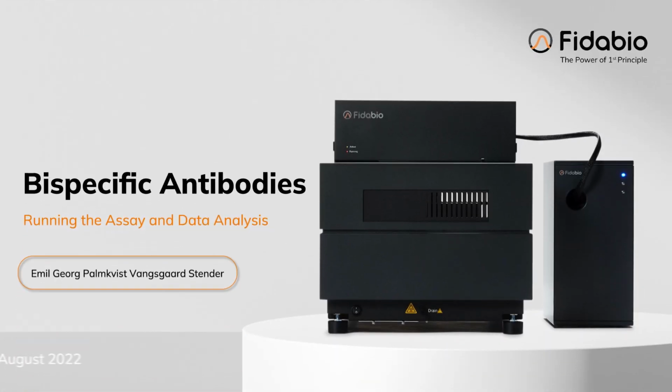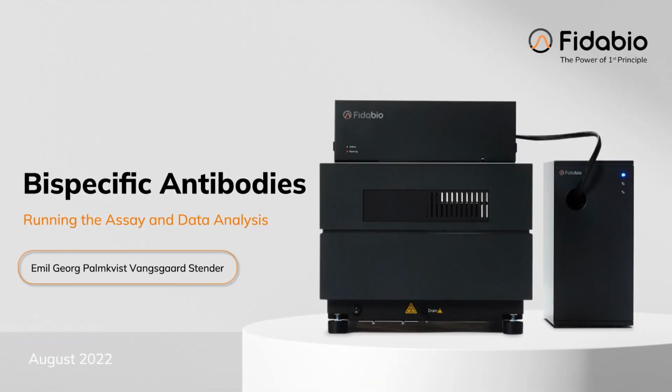Hello everyone, and welcome to this overview of assaying bispecific antibodies with your FIDA. In this video, we'll be going through the experimental setup as well as the subsequent data analysis.